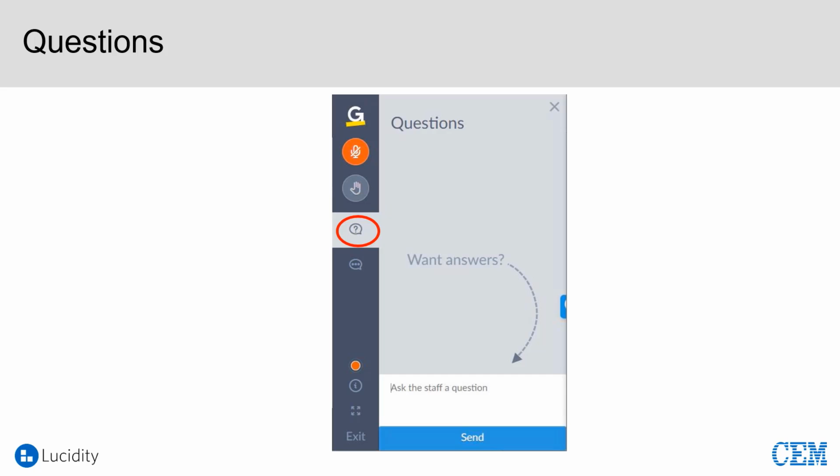So then, what are some challenges with making a GC smaller? I really enjoyed it, I was very happy when Lucidity showed me how to open the cover on the box and look in there. And I think the big challenge, as I mentioned a little bit right away, is that as we make things smaller, we still have to interact with them. We still have to put our hands on them. We still have to put our hands inside them.